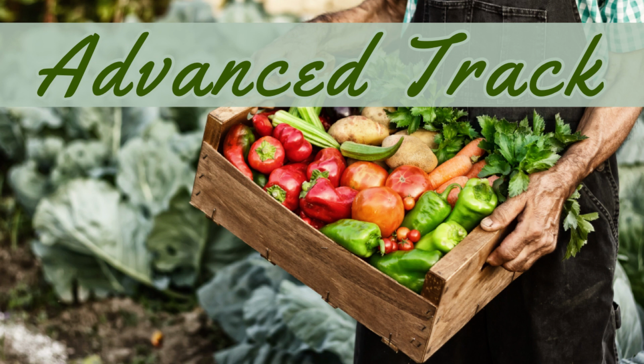Got a little... no, this is reality TV. I could hook this into the TV. This is what my kids say, Dad, did you see that? Right? That's the slide drying. Like everything shifting all at one time is the slide drying and shifting over. So don't panic. They ran away from us. Yeah, see? Exactly. Hopefully not. It is alive. Actually, it is alive.